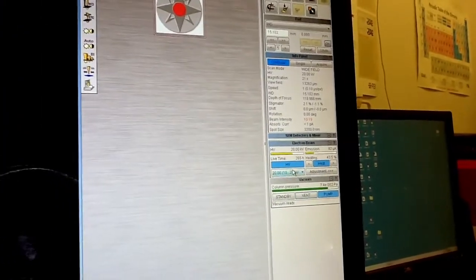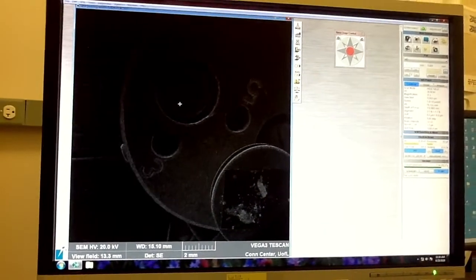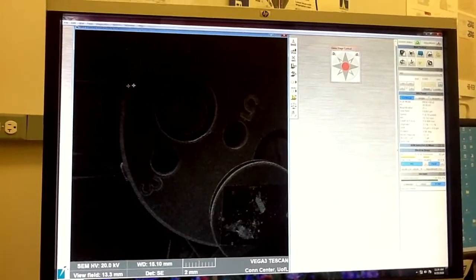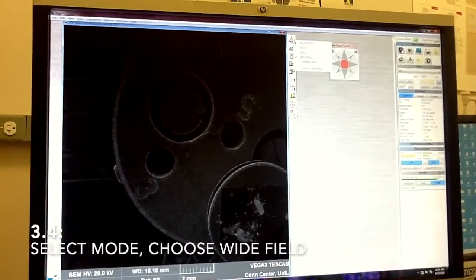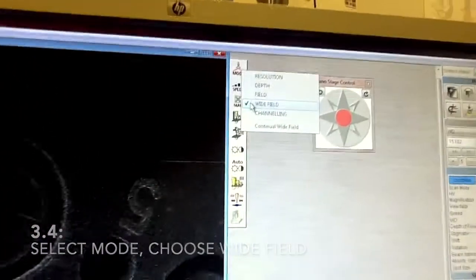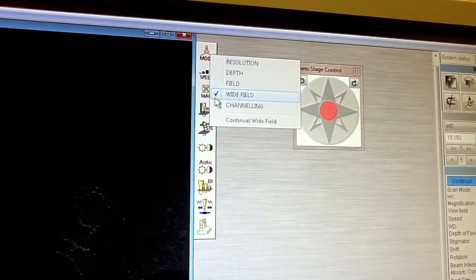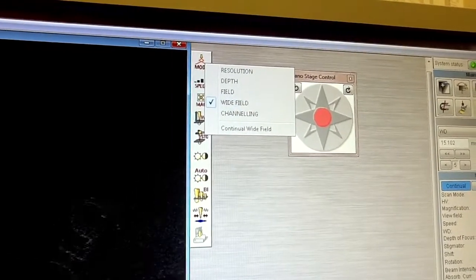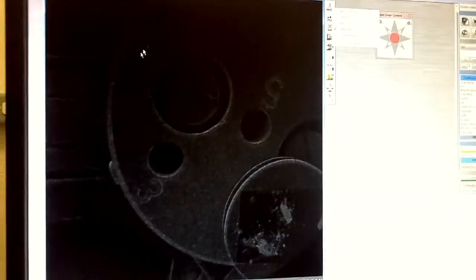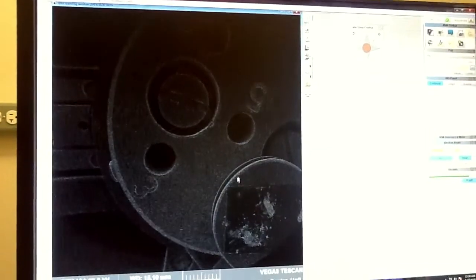You should be able to see the emission current. Now you should be able to see the image. If you are in continual mode you should see a live image of your sample. Check that you are in wide field mode — this is low magnification mode just to orient yourself where your sample is.